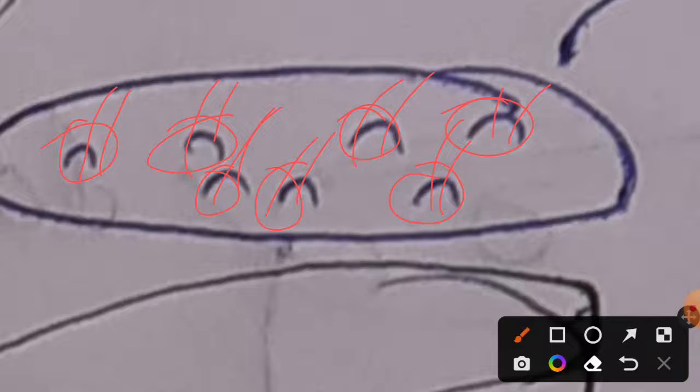Okay, then when you apply the washing step, all the cytoplasm, all the ribosomes, all the cytoskeleton, all the mitochondria that are present inside those cells will be washed away except the DNA. Okay, why? Because at the very first point, during the starting of the topic of colony hybridization, we discussed that nitrocellulose membrane has special affinity towards DNA, right?